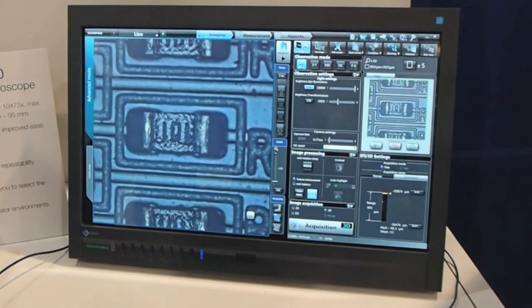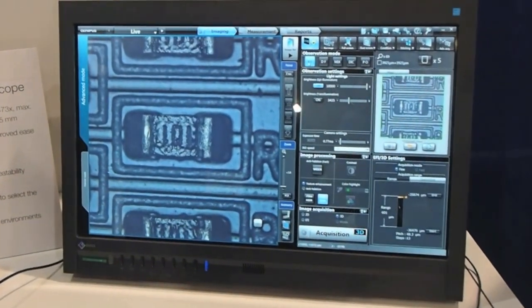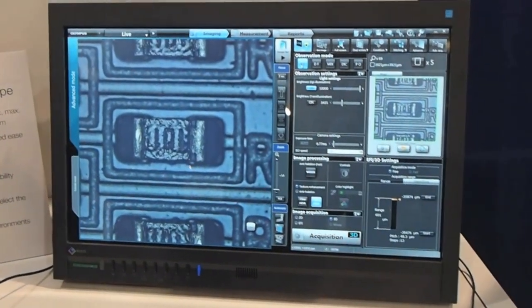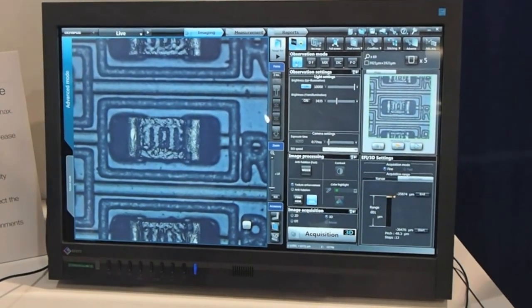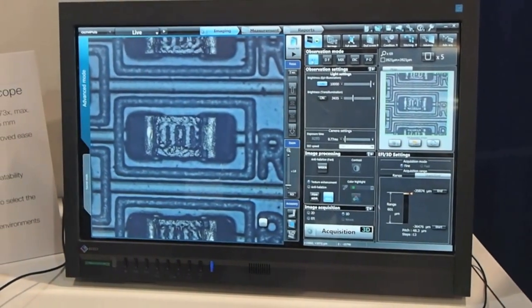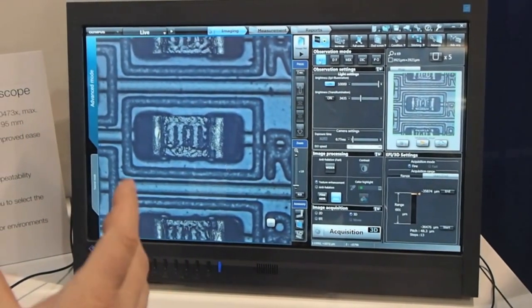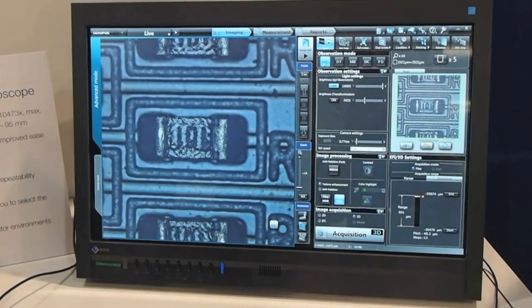I'd like to show the best image feature. When we first start and look at a sample with a bright field view, we're not necessarily getting the best image possible.